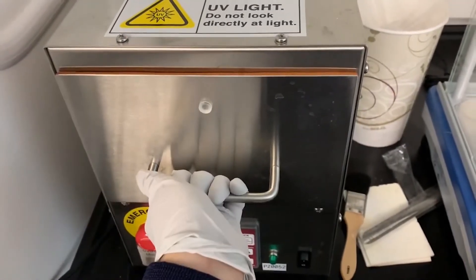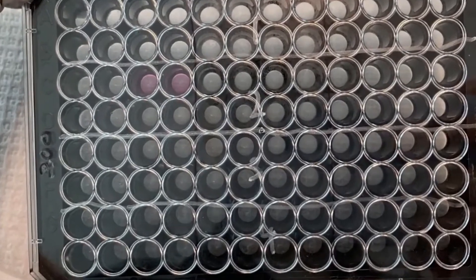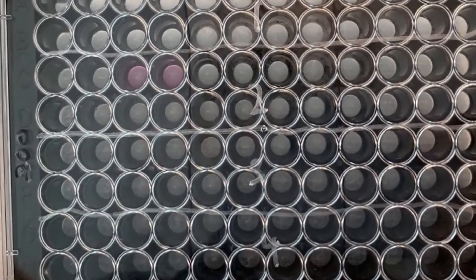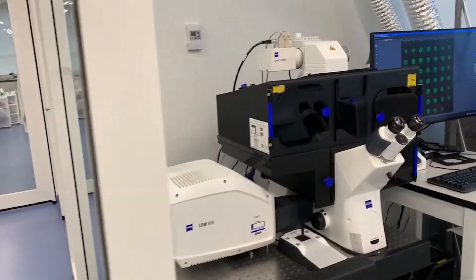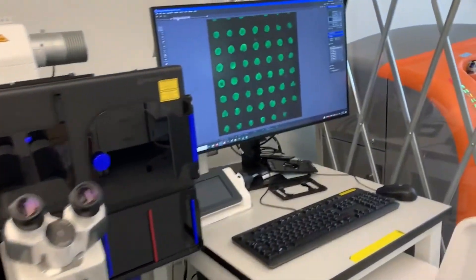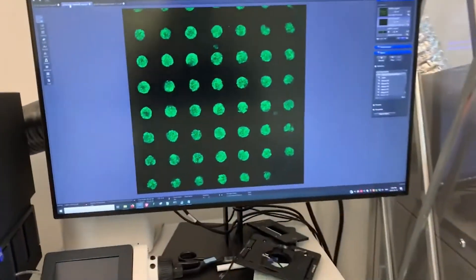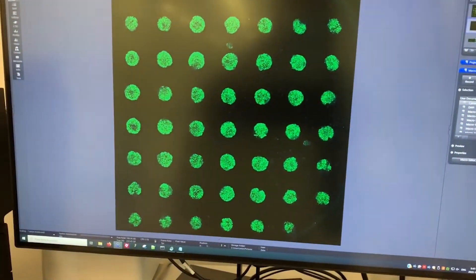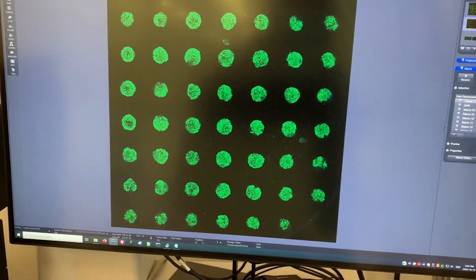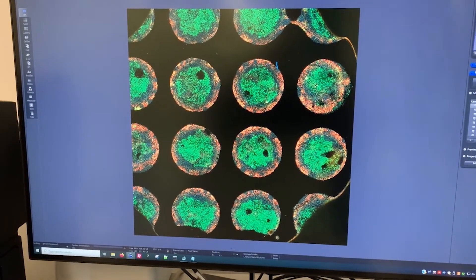But if you really want to see our micropatterns, you need to look at them through a fluorescence microscope. Here, we see some colonies of stem cells, which are organizing spatially and acquiring different fates depending on their position within the micropattern geometry.